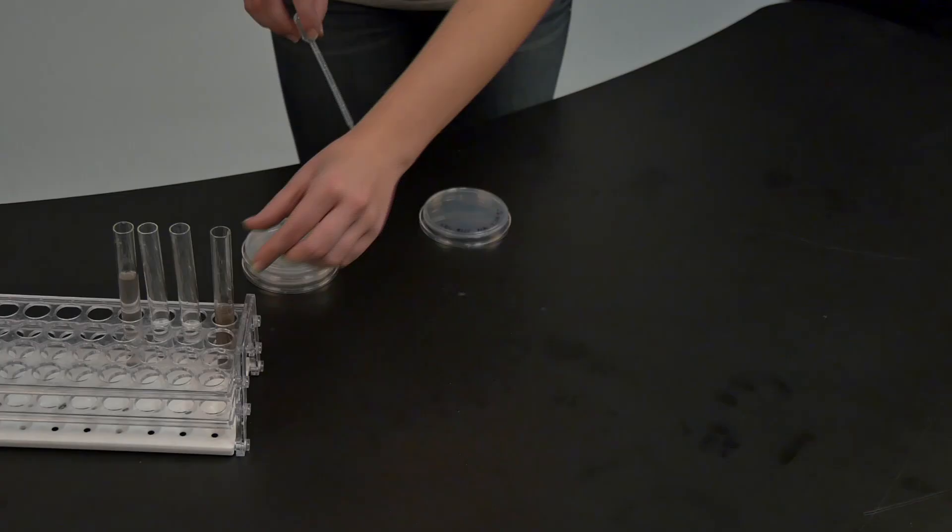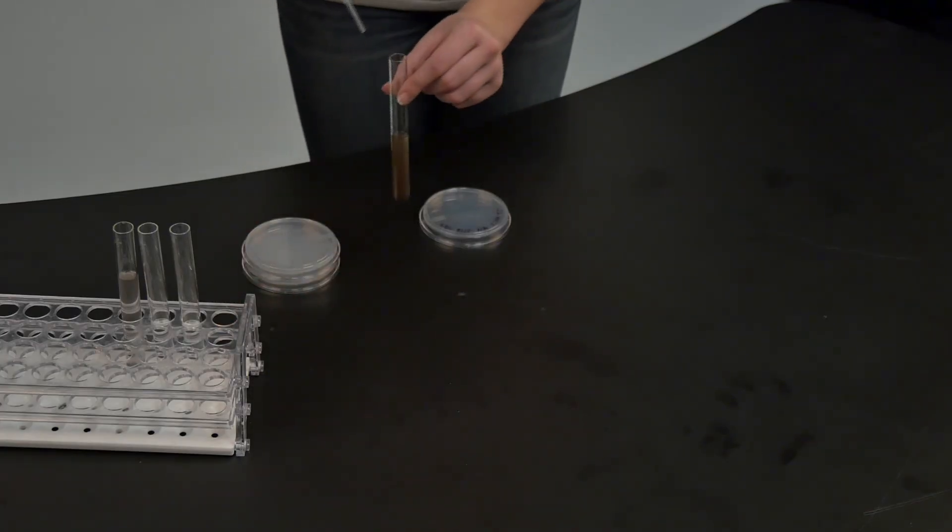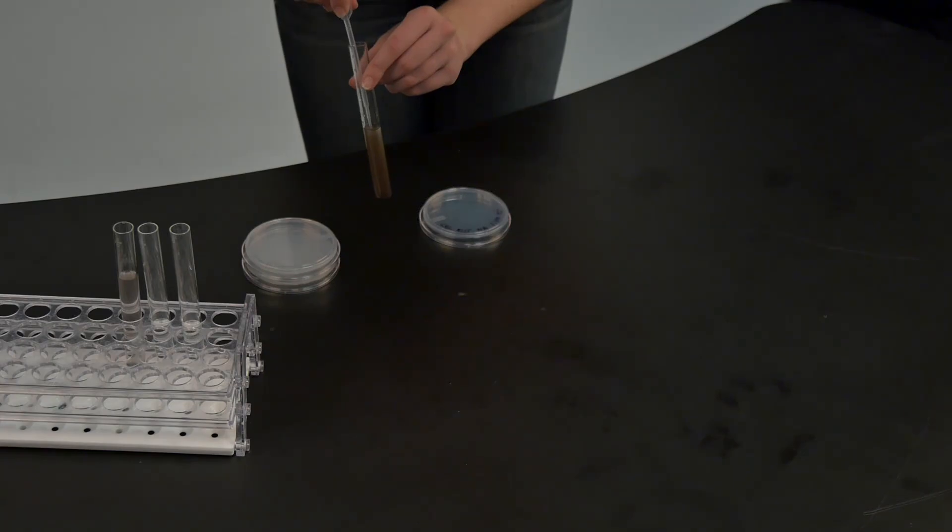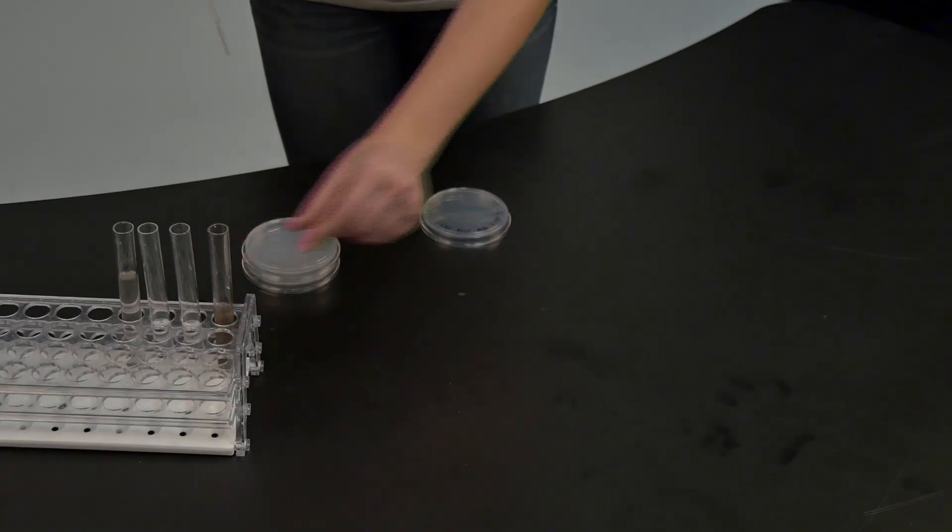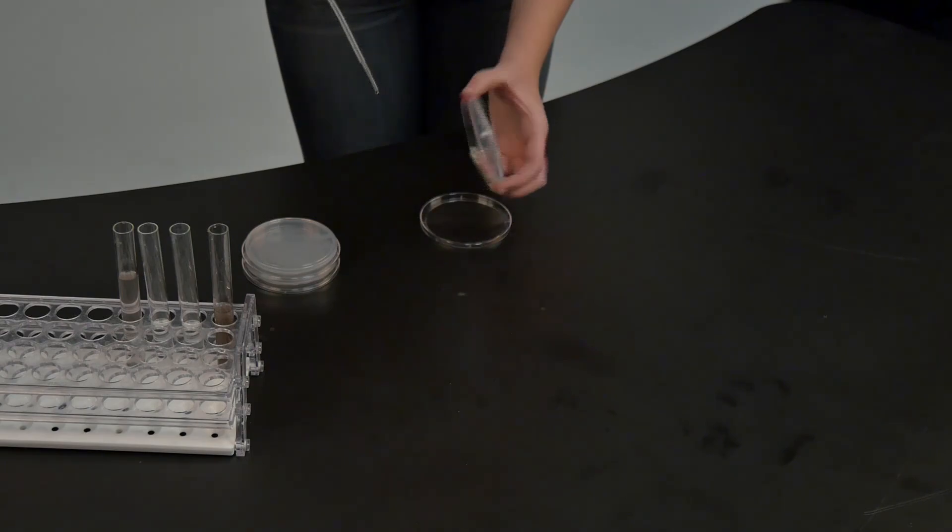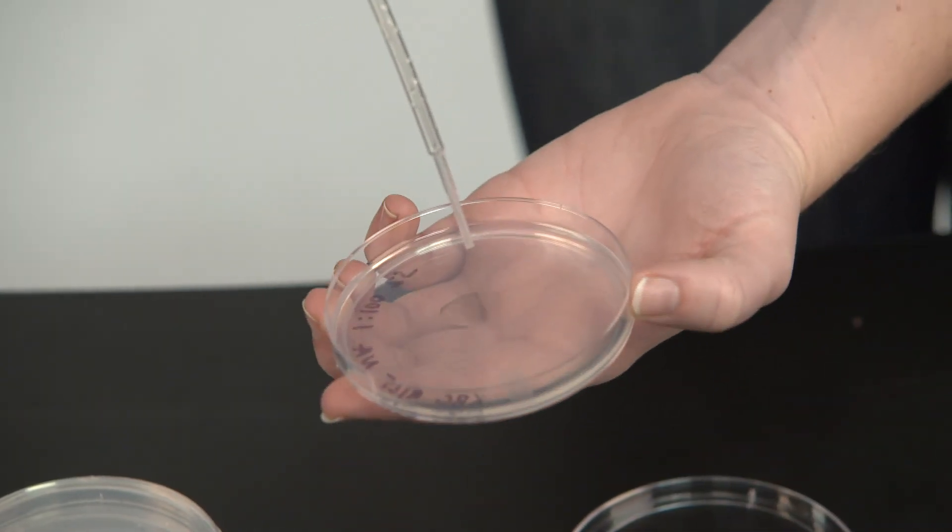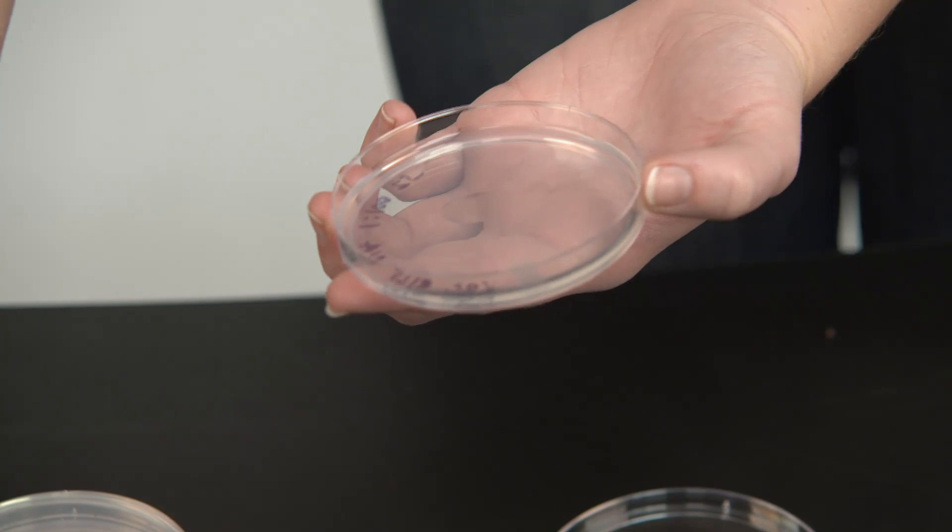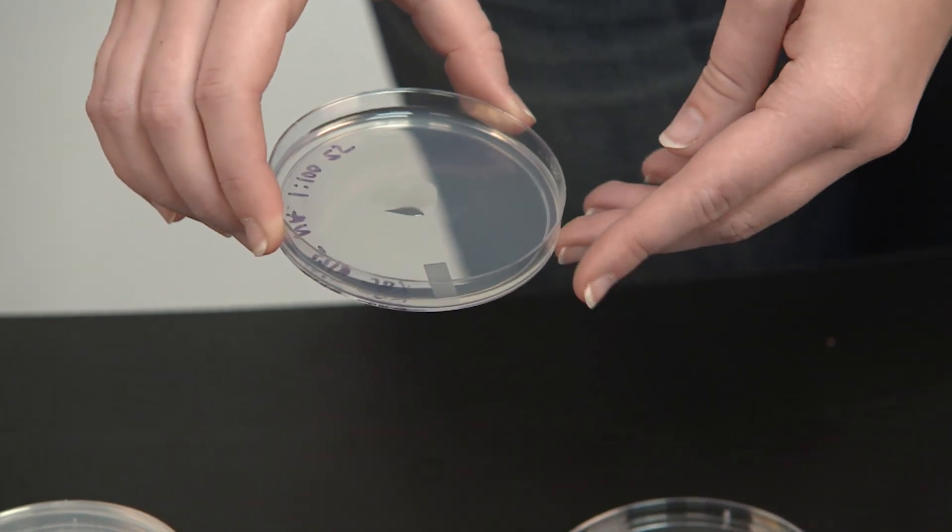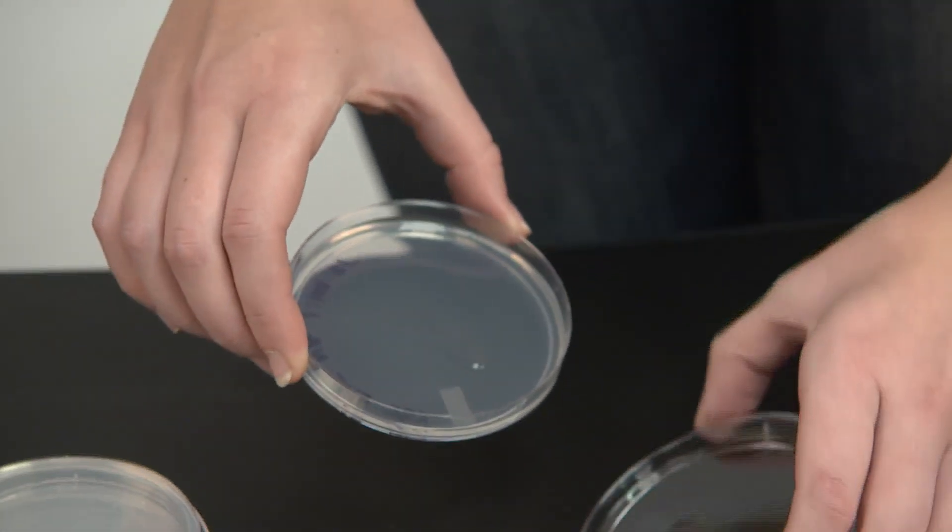Transfer 0.1 milliliters of solution from each of your containers. You'll notice on the plastic transfer pipette that the 0.1 milliliter marking is at the very bottom where the indentation occurs. When you transfer this, you'll want to aliquot it onto the agar surface of your petri plate. Make sure that there are no air bubbles in your plastic transfer pipette.